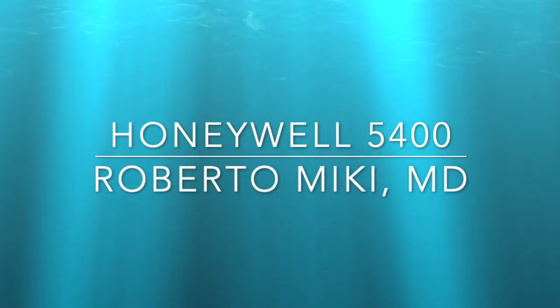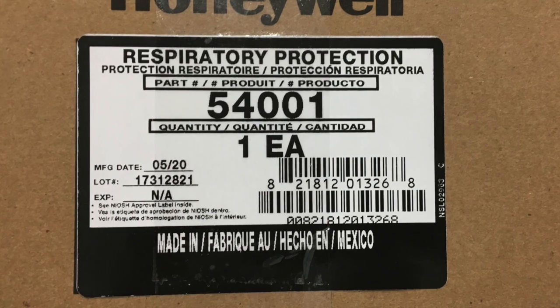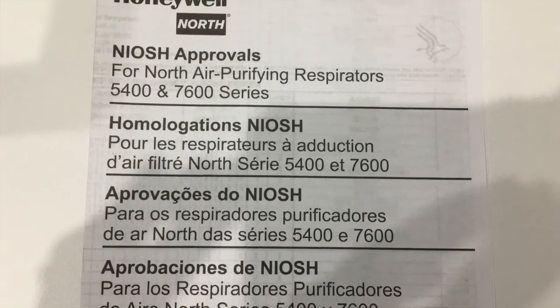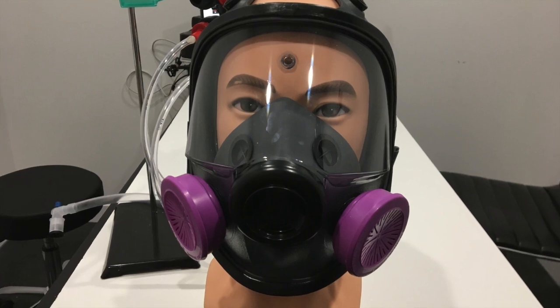Hi, it's Roberto Mickey again, and we're going to be reviewing the Honeywell 5400 full face mask respirator. This is the box, and here are two of the manuals that you can find within the box, and here's the mask from the front.